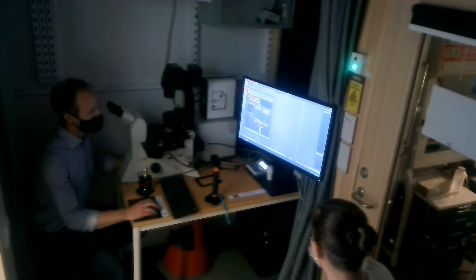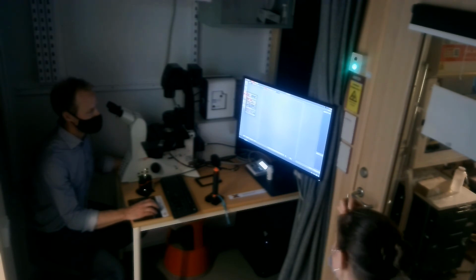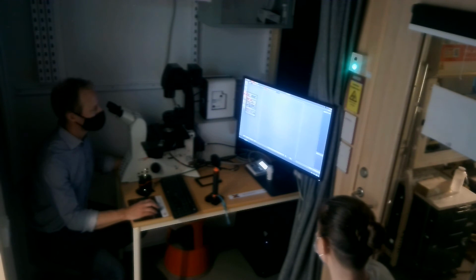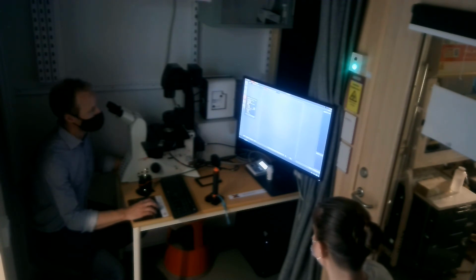Beam path is this window that we recognize. It looks the same, it's the same settings that have followed over. Image, it's the same thing here. We have the exposure, so the camera settings, the different dimensions. You can see that these 2 buttons are missing because we are already in Navigator. So projects, this is this one.